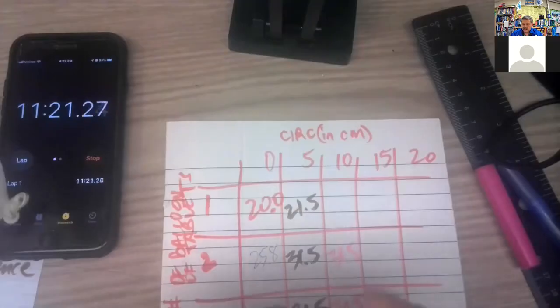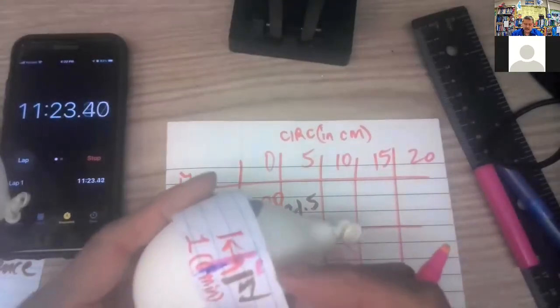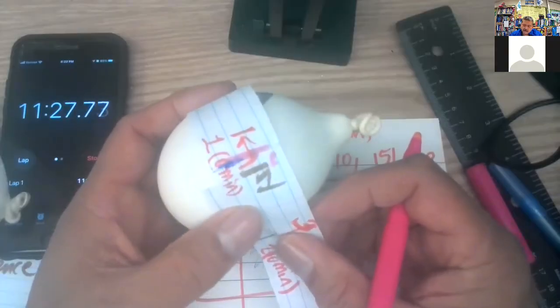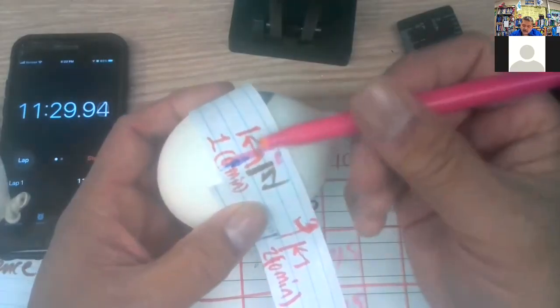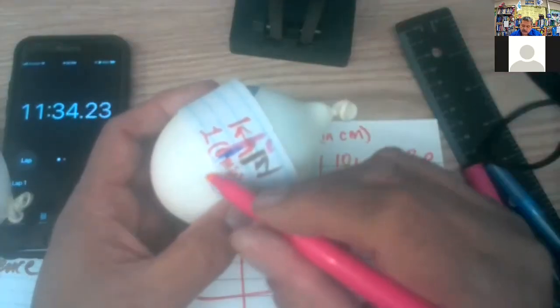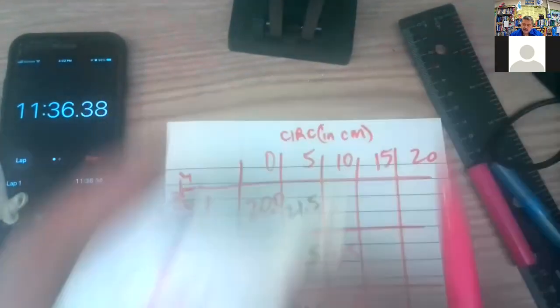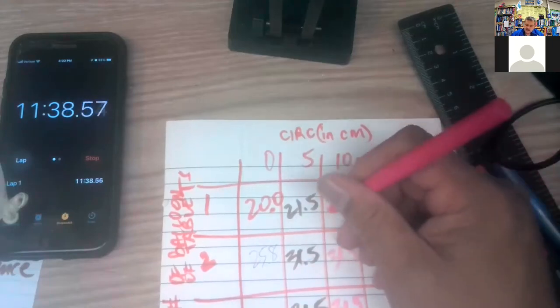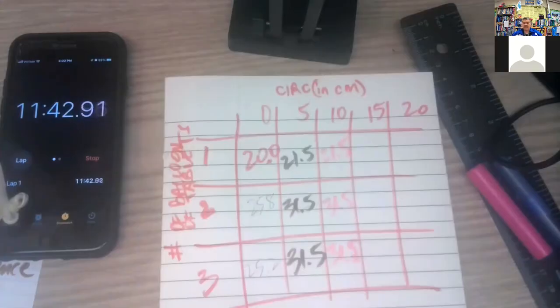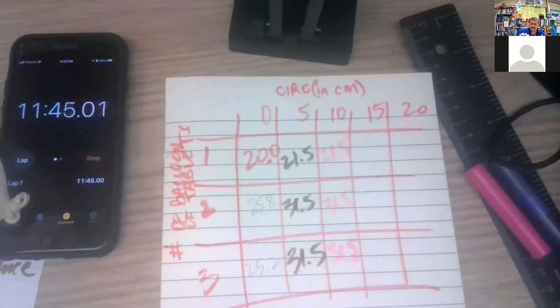Why should it go down unless it's very slowly leaking, or maybe I measured it in the wrong place. Oh, look, I redo it. Instead of being right there, I measure it the same exact way. The same. So I think that our reaction has peaked out.